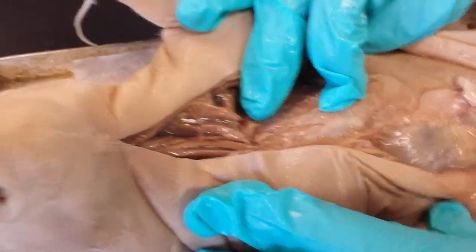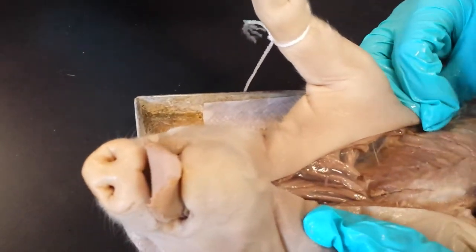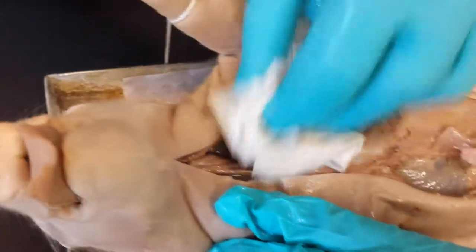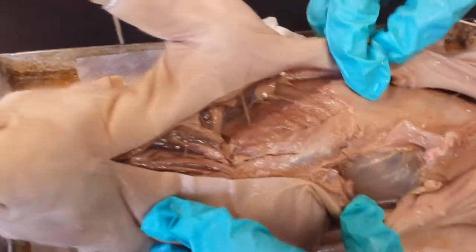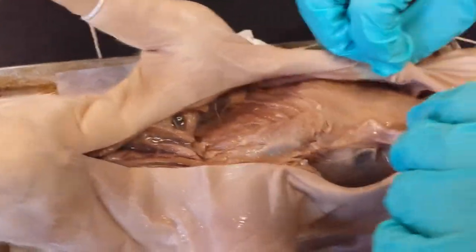What did this pig have before his untimely death? Well, I don't think he was born yet. He still has a little thing attached to him. Umbilical cord? Yeah, I think it's a girl because it has like nipples. Oh, okay. So we have to name it a girl name. Hamlet. Penelope. Yes.